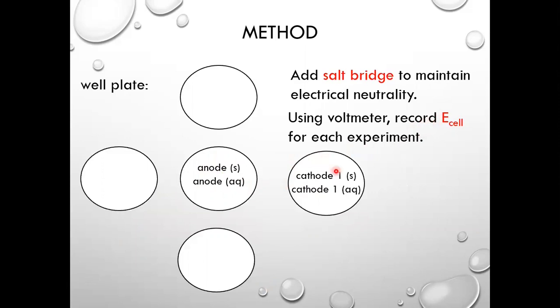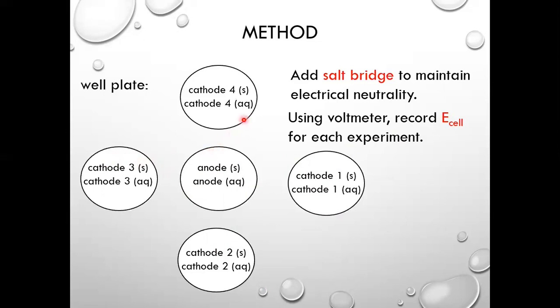We'll do that for experiment 1. Experiment 2 will be with a different cathode, but once again, the same anode. Experiment 3, cathode 3, and finally experiment 4 will be with cathode 4.